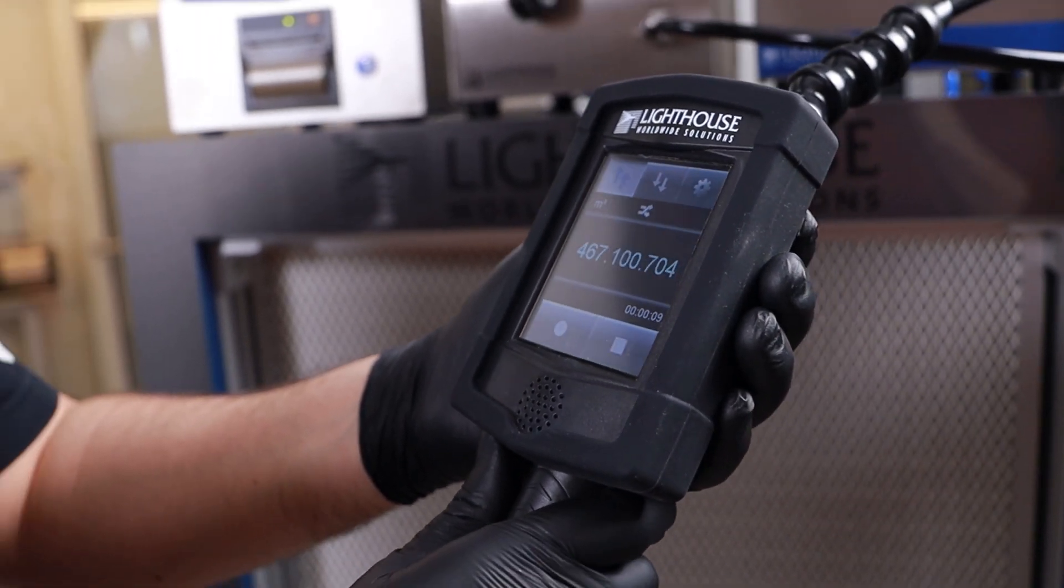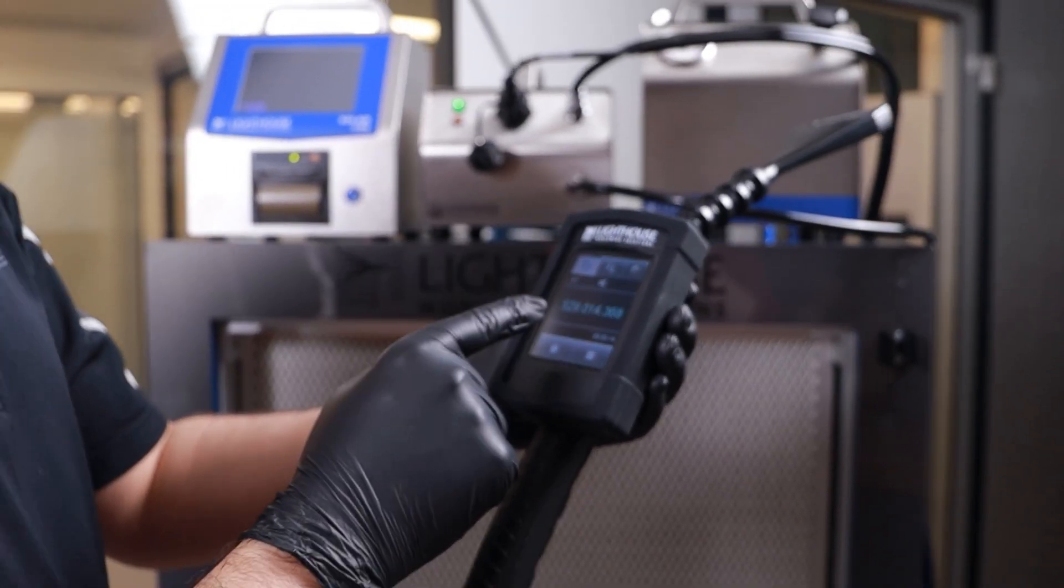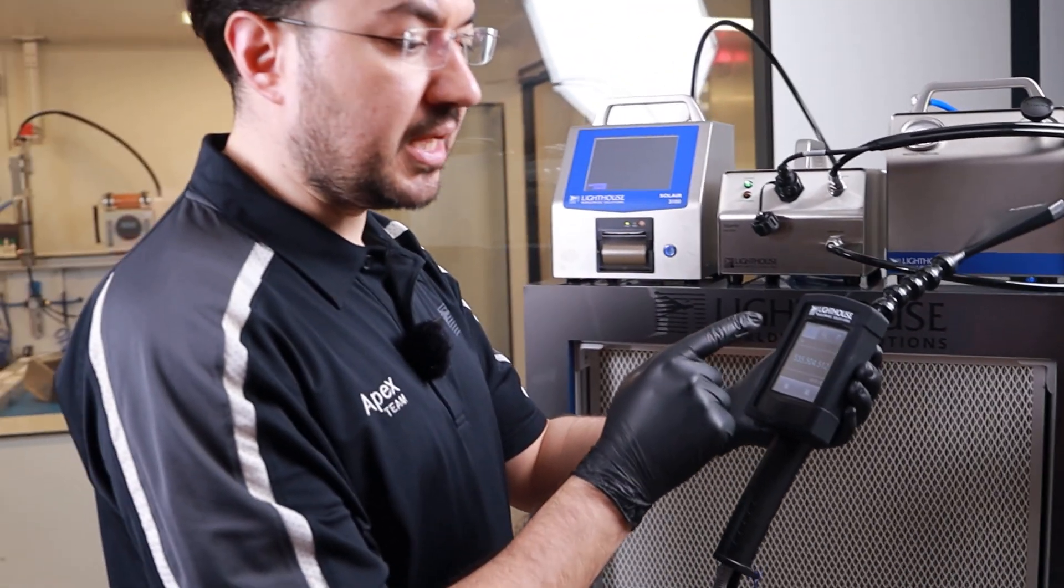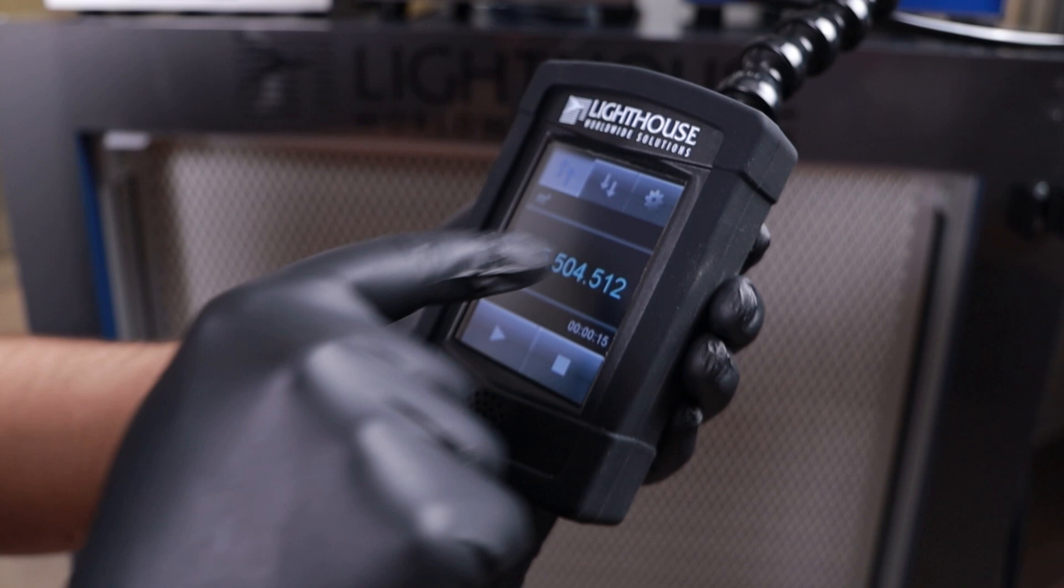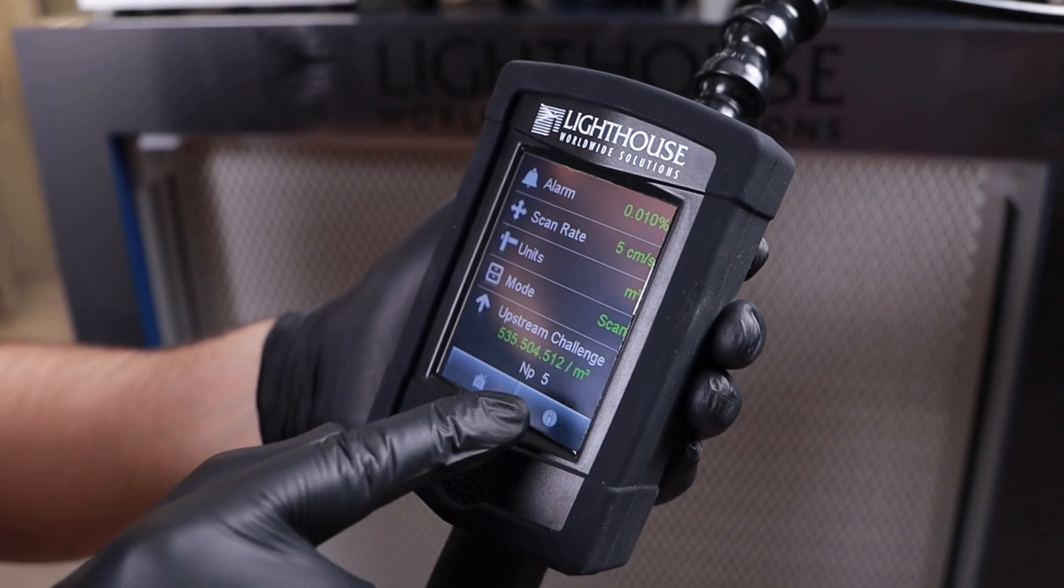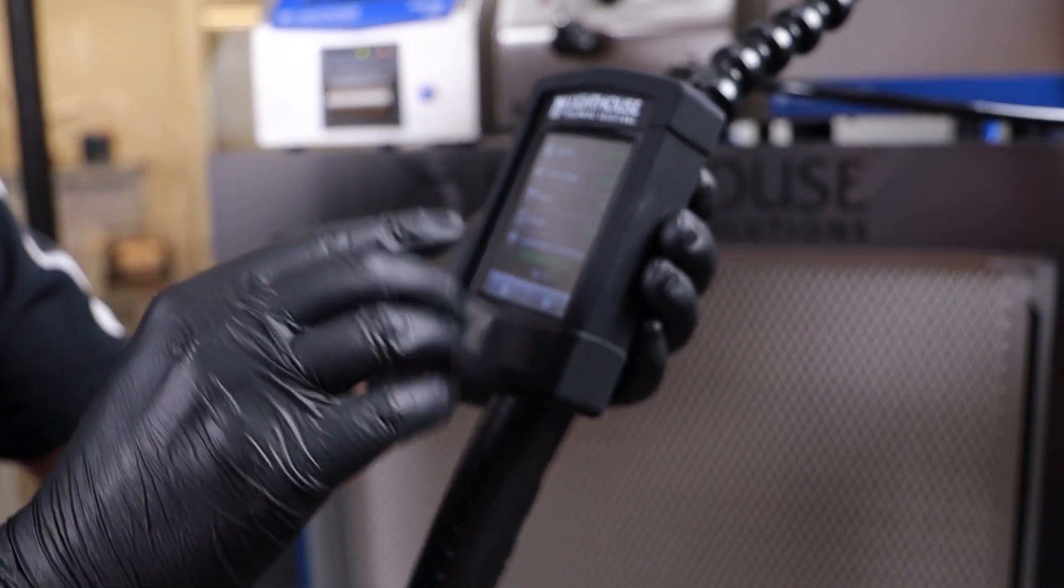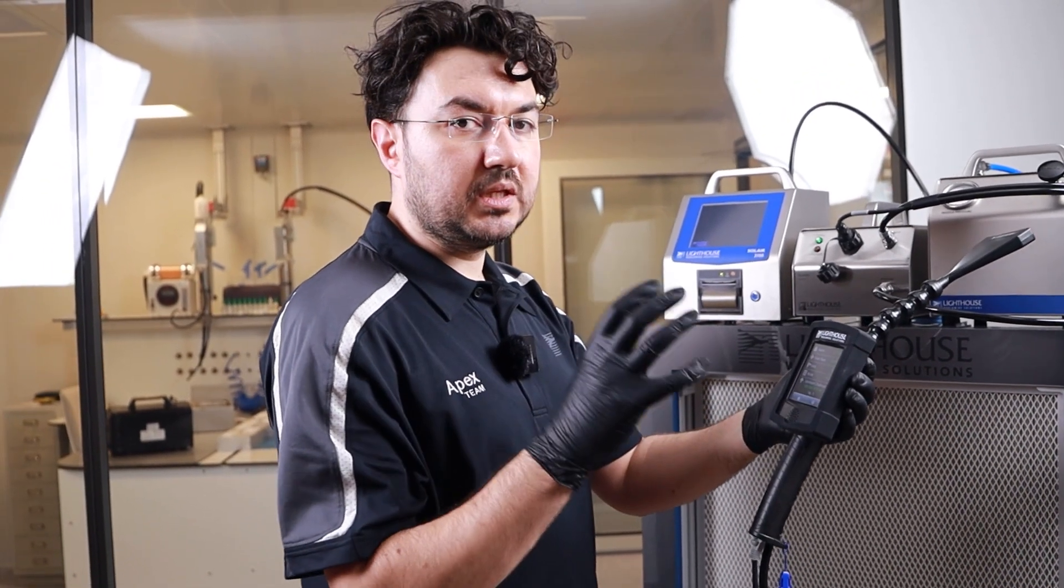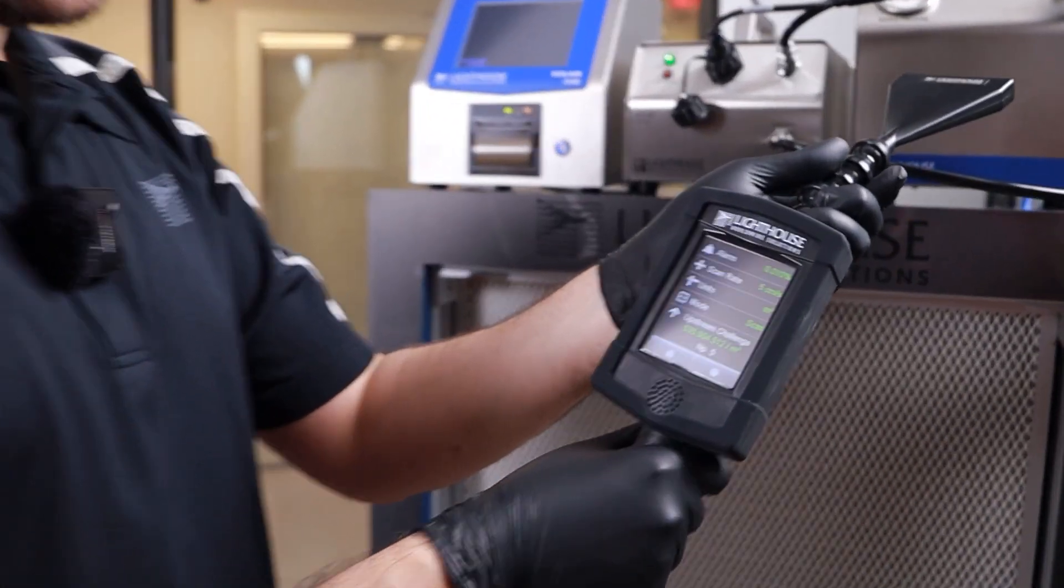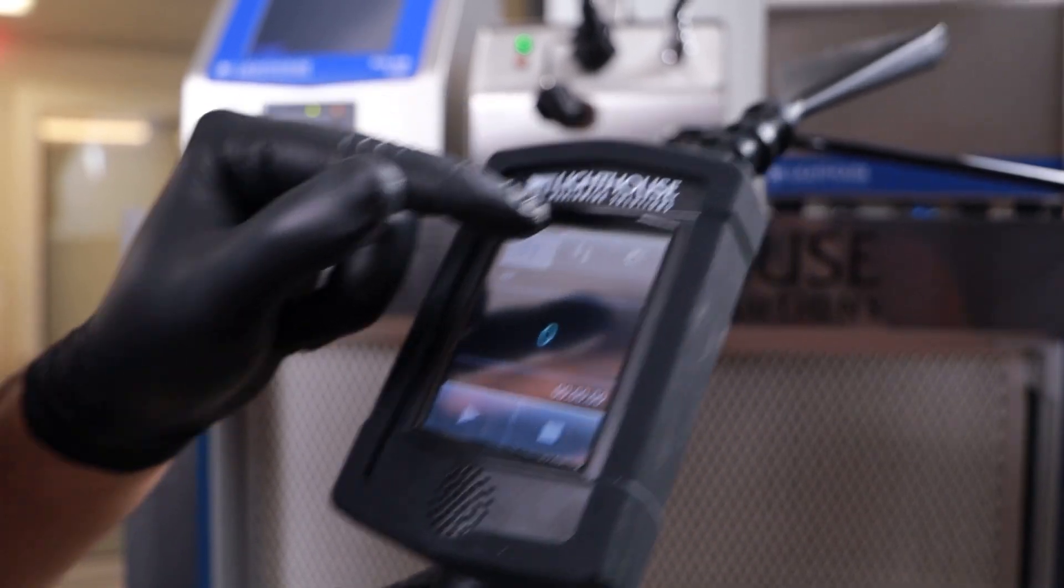Thanks to ScanAir Pro, the system scans the homogeneity of the particles that are sampled every second. If it is not homogeneous, then the system gives you an alarm. The sample is not homogeneous. So repeat it again. Now we have a homogeneous and a high count. Now my NP value become 5, which is good to start with. You shouldn't be lower than like 4 and higher than any other numbers, but within between these two limits. So 5 NP is a good number to start with, so I'll start scanning my filter.